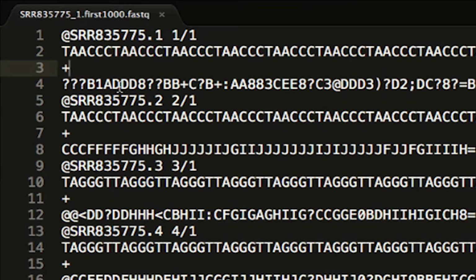So if you remember from lecture, each quality score is Phred33 encoded. This converts it to an ASCII character, and that's what's printed in the 4th line here. So this file is sequencing reads from a real human being. So these are actual human sequencing reads we're looking at.